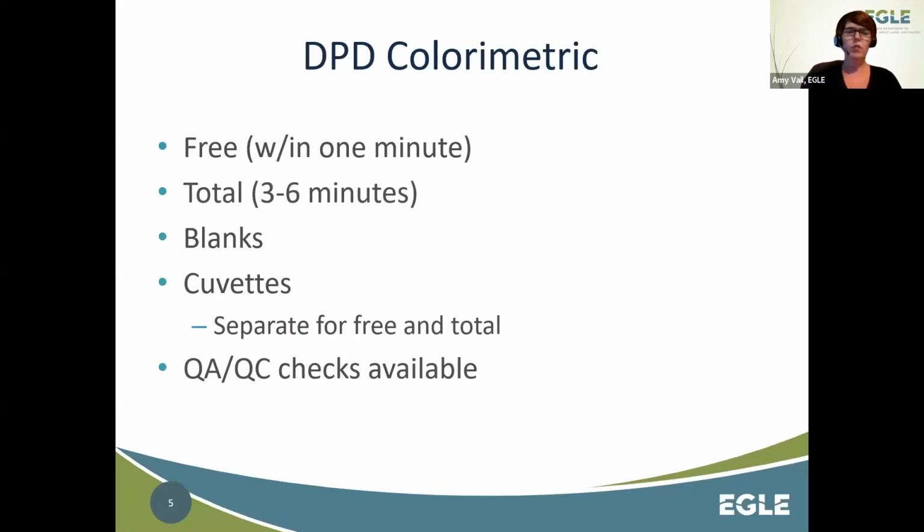And so sometimes people will use distilled water for blanks, and that's not a good thing to do because you're not testing like with like. So if you say distilled water means it has nothing in it, and then you test a little bit of cloudy water or discolored water, it might read that it's actually got higher chlorine in it than it does. Again, the cuvettes are important because, like I said, trying to separate a free and a total cuvette, in case there's any extra powder in there that you didn't rinse out, you're not getting false readings from that. You want to make sure that your cuvettes are scratch free and dry when you do the analysis.